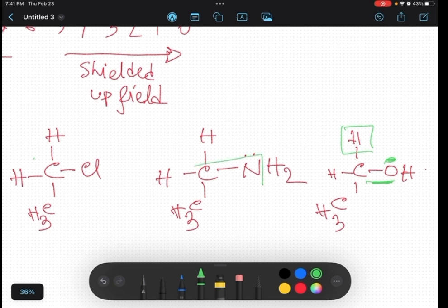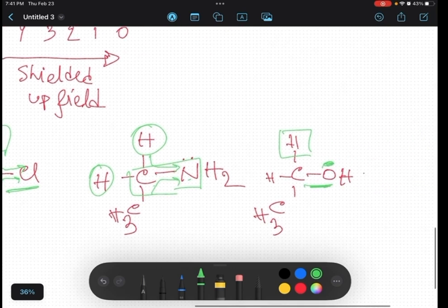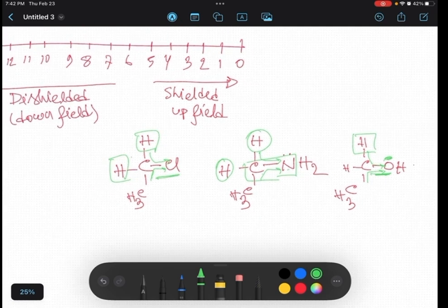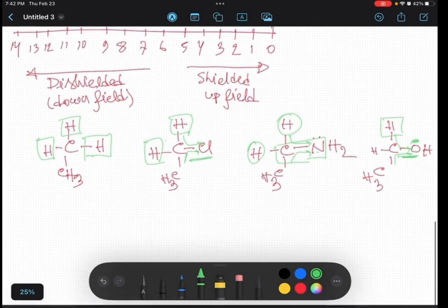Any carbon next to the nitrogen, those protons will get impact from this nitrogen. Similarly any proton next to chlorine or bromine or iodine will get impact, because the electron density will be pulled by the electronegative atoms. Nitrogen is an electronegative atom, so it will pull the electron density to itself, and that's why those protons will be more de-shielded, a higher ppm value.